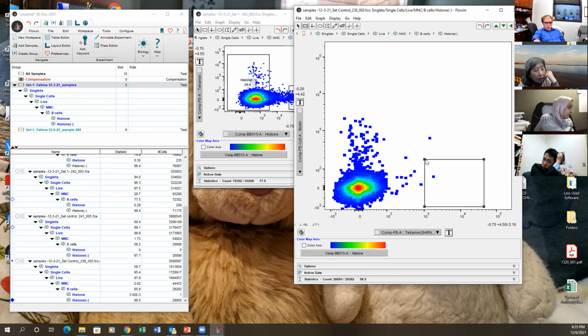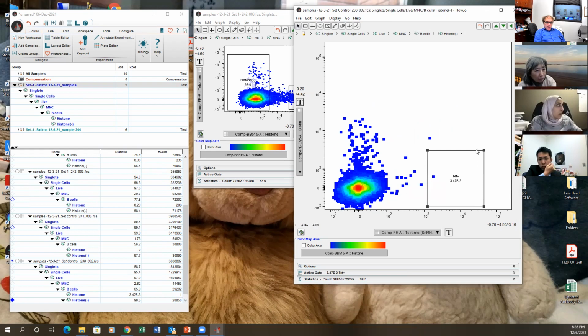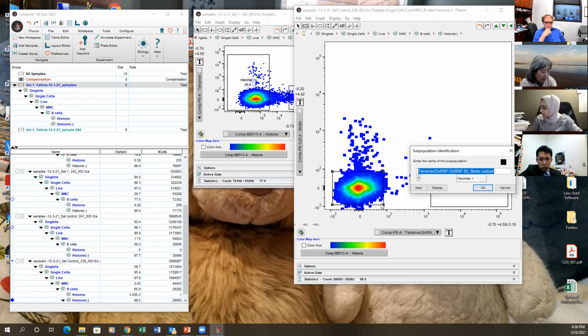There's another critical gate coming up. So you try to get the SM positive here. And that's a control, right? The biotin control. Right, this is the biotin control. So it eliminates the biotin control. So then now you just got the ones. Right, unfortunately I cannot remove it all.